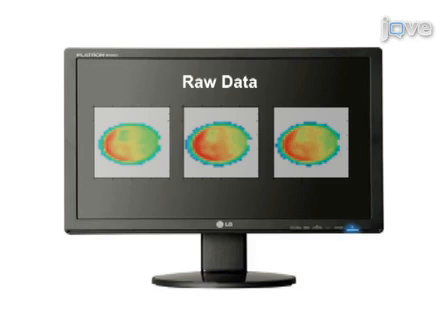This is carried out for several variants of pulse sequences and often under various external conditions, such as under light and dark conditions. Next, the raw data images are processed by the computer in order to extract the three-dimensional spatially resolved relaxation times of the radical. These relaxation times provide a direct measure of the oxygen concentration through pre-existing calibration, leading to full three-dimensional oxygen maps of the measured samples under various external conditions.